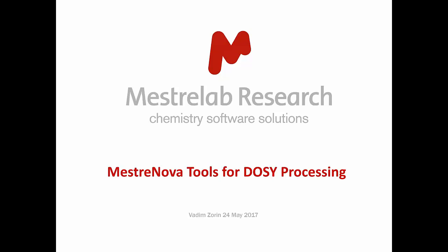Good afternoon, Enrique. Thank you very much for the introduction. Yes, as Enrique mentioned, today I'm going to talk about DOSY processing and tools available in MestReNova to perform DOSY processing. This is a quick outline of my webinar.